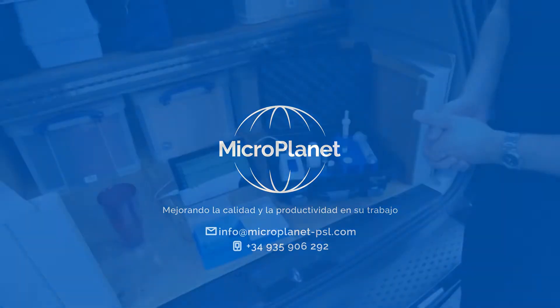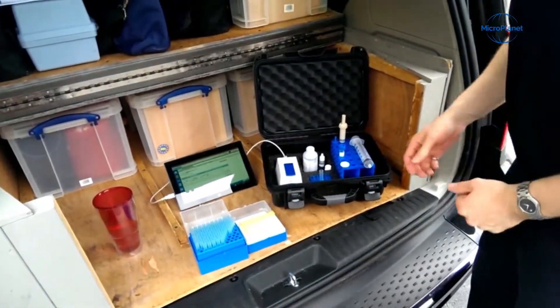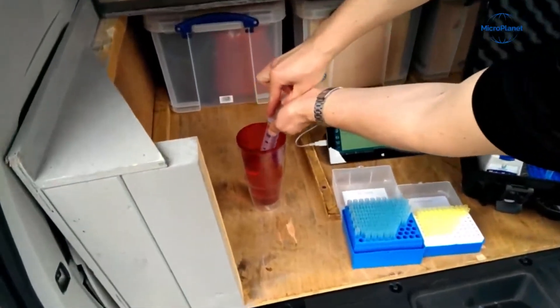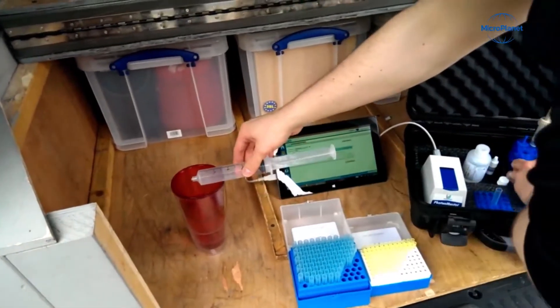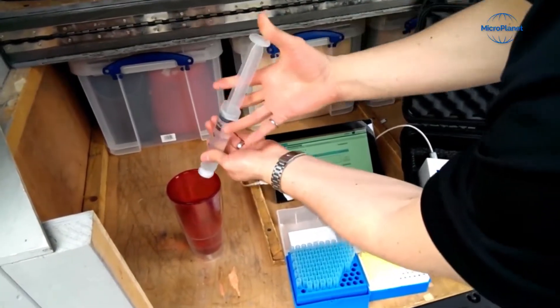To demonstrate the portability of the QGA protocol, we'll be testing some potable water here in this parking lot. First thing we do is to draw 60 milliliters of water into this syringe, and we concentrate the cells on this filter.